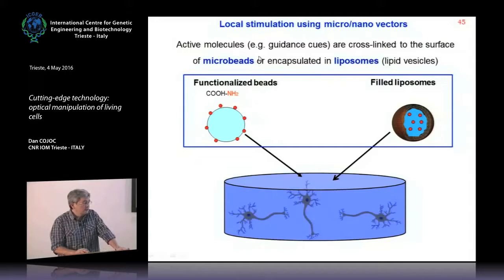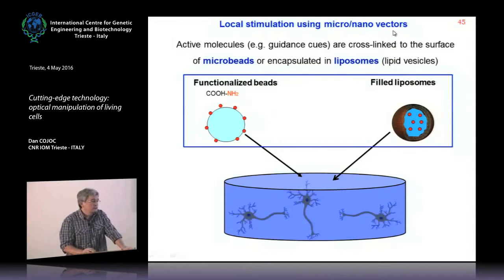So now I will show you the use of two types of vectors: microbeads and lipid vesicles.